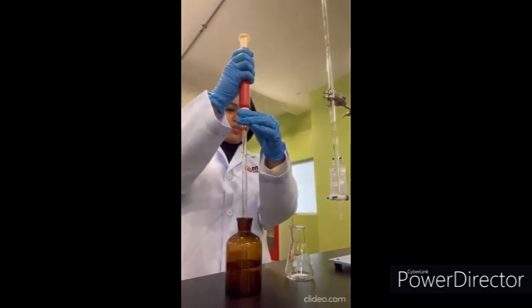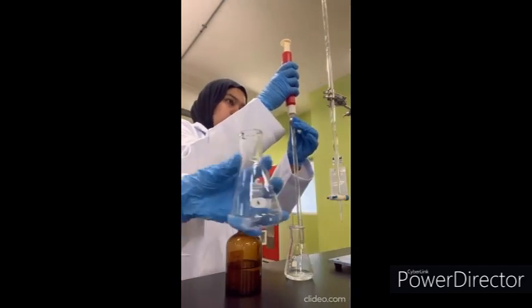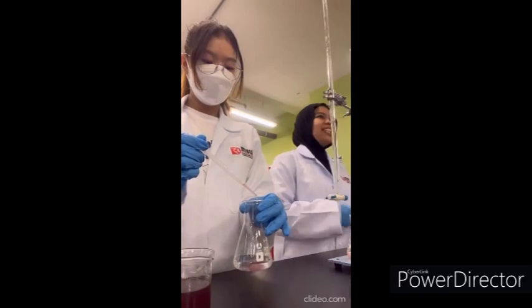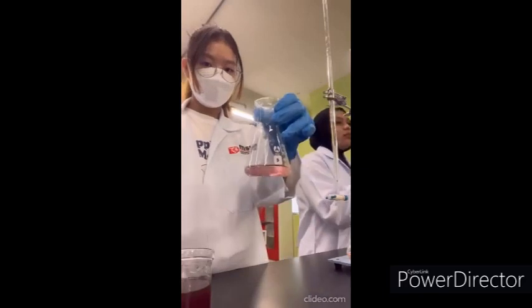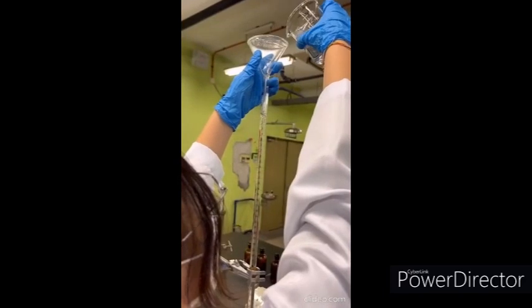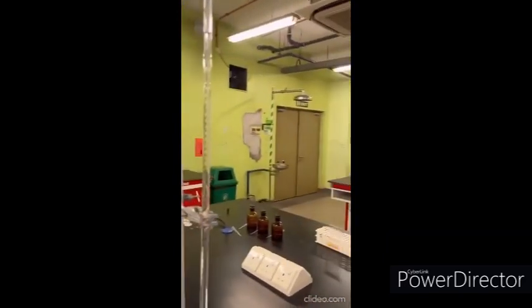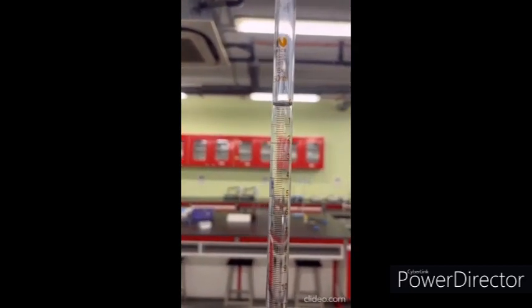Firstly, pipette 20 ml of hydrochloric acid with a molarity of 1.0 into 2 conical flasks that are labeled as A and B. Using a dropper, add 10 drops of onion extract to the hydrochloric acid in flasks A and B, and it will be used as the natural pH indicator. Fill the clean burette with the sodium hydroxide with a concentration of 0.2 molar until it reaches the 0 mark, which indicates 50 ml of solution. Make sure that there is no air bubble in the burette and measure the initial reading.